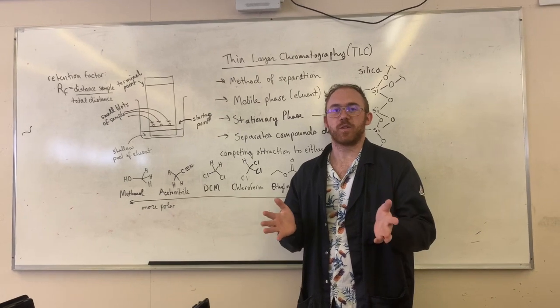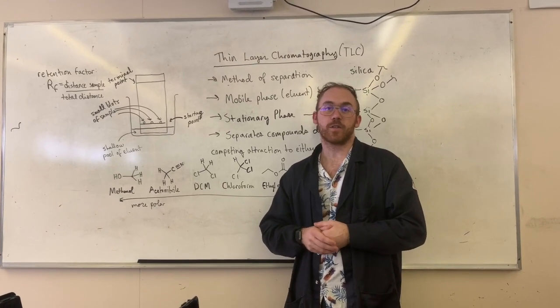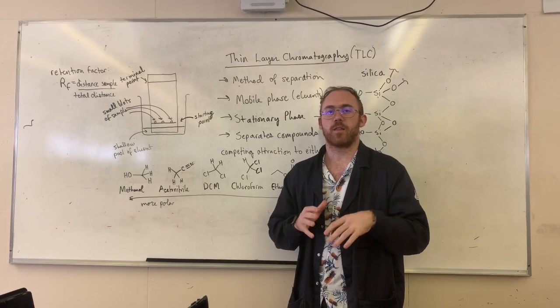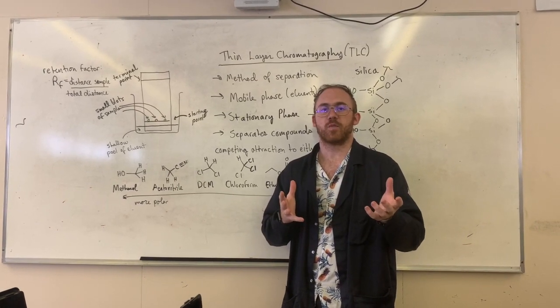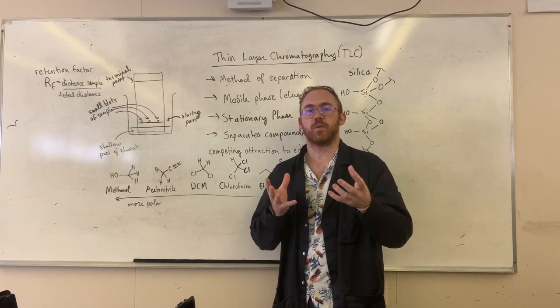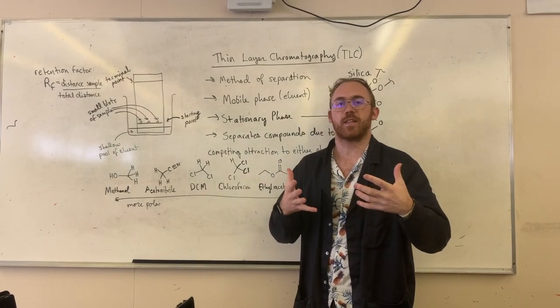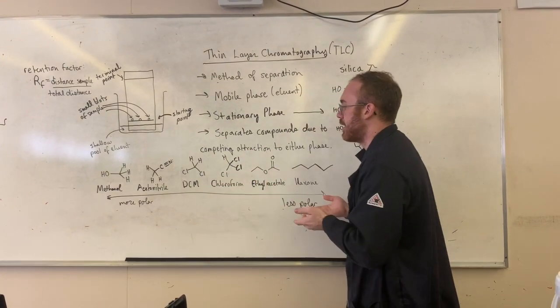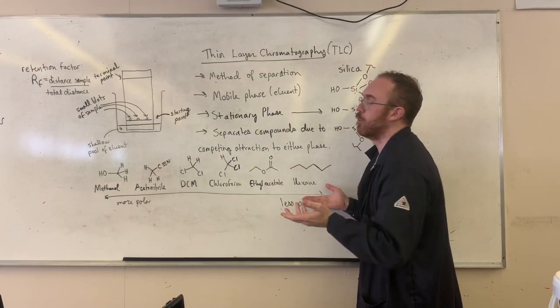Welcome to Experiment 2, Thin Layer Chromatography, also known as TLC. In this particular lab, you're going to be working with the difference in attraction between two compounds that you have in, let's say, a mixed sample, and trying to separate them using their polarity differences based on any number of these solvents that you would use for a mobile phase.